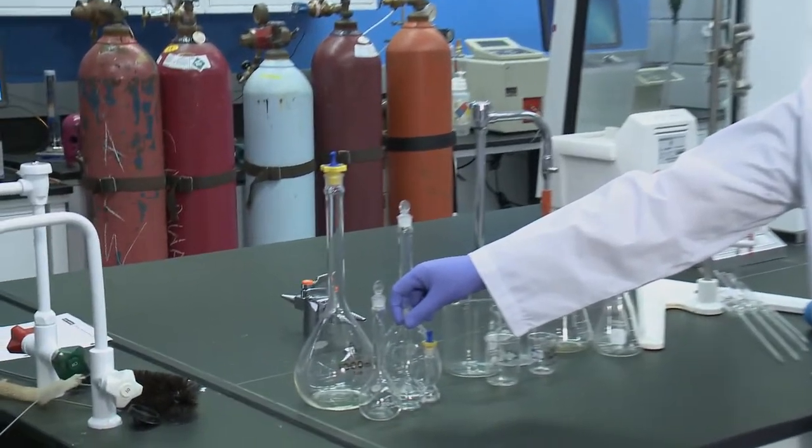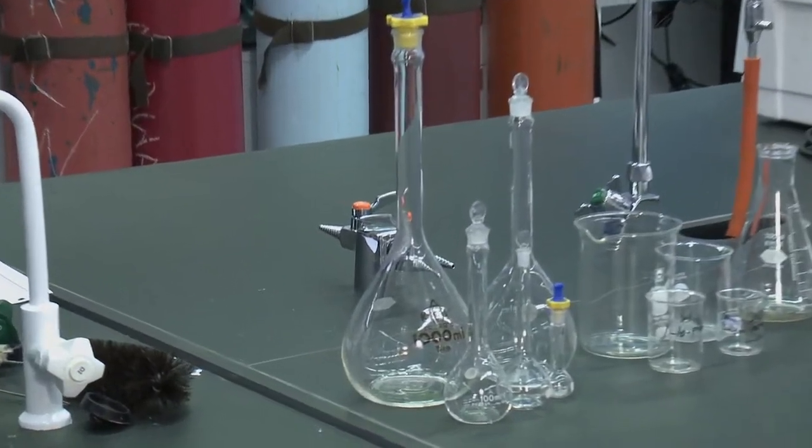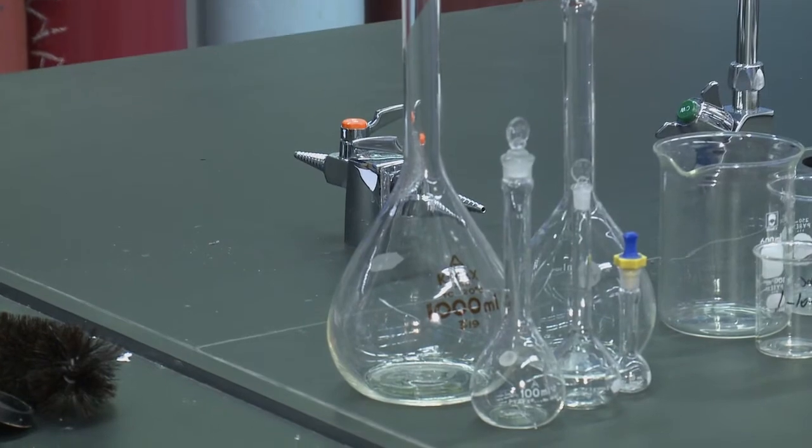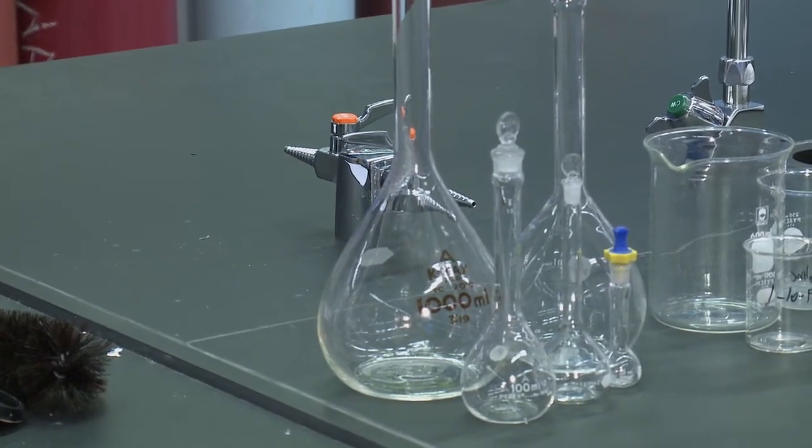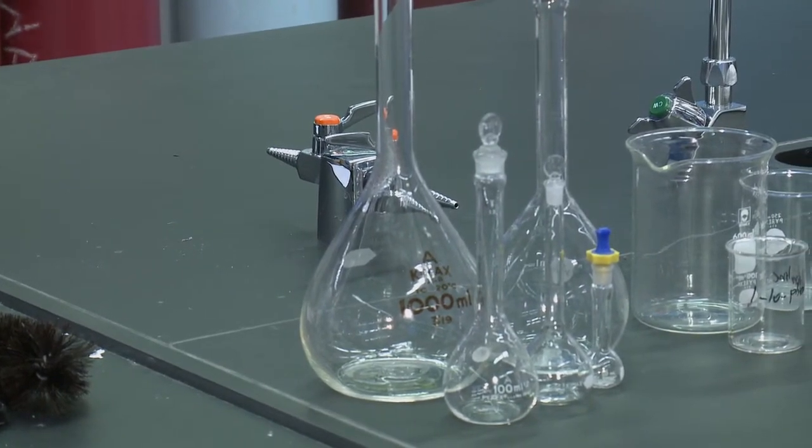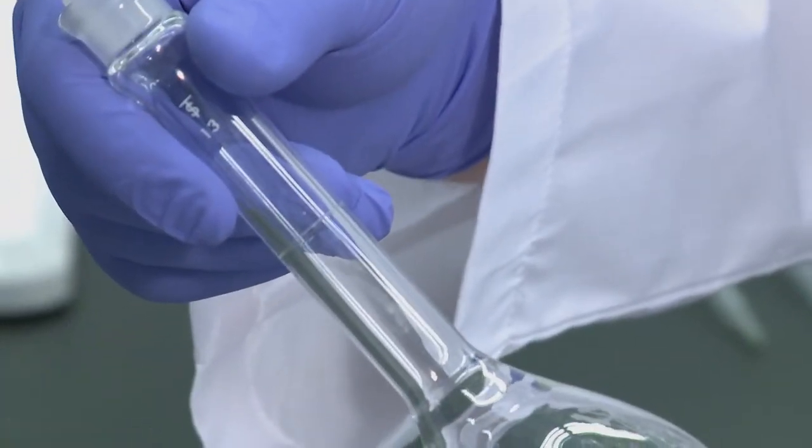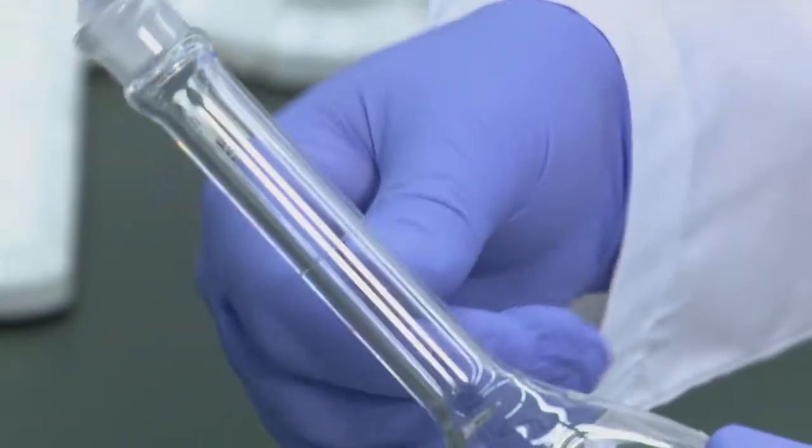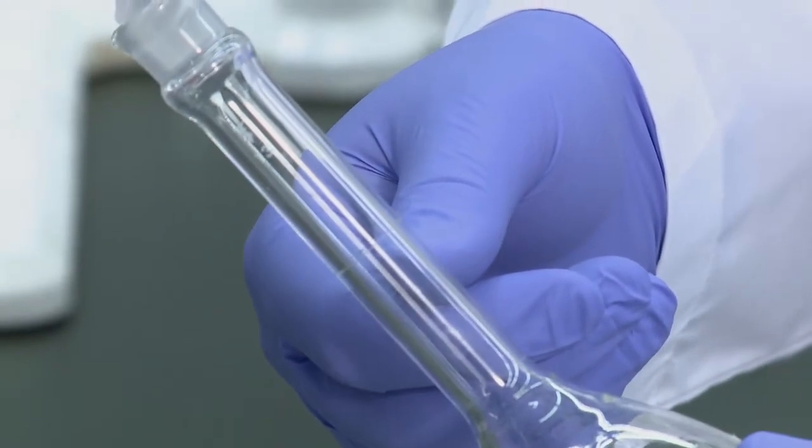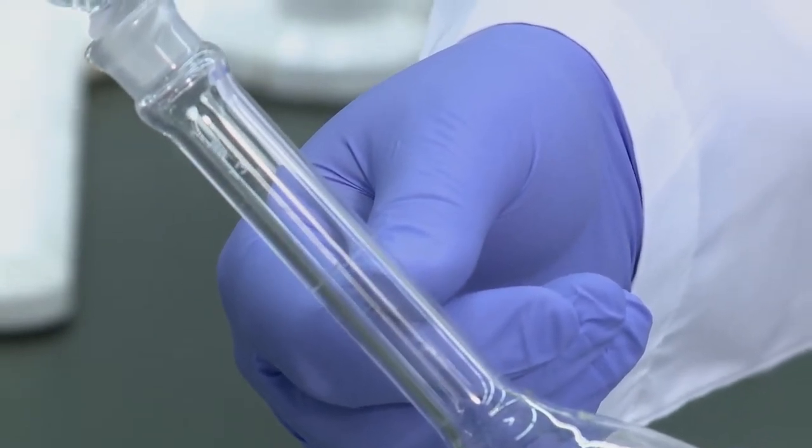First, we have various volumetric flasks. These are used to make very accurate concentrations of different solutions. Each one comes with a single mark on it and can only be used to produce the volume that is on the label of the flask. These will be used to produce most of your standards and unknown samples in experiments.